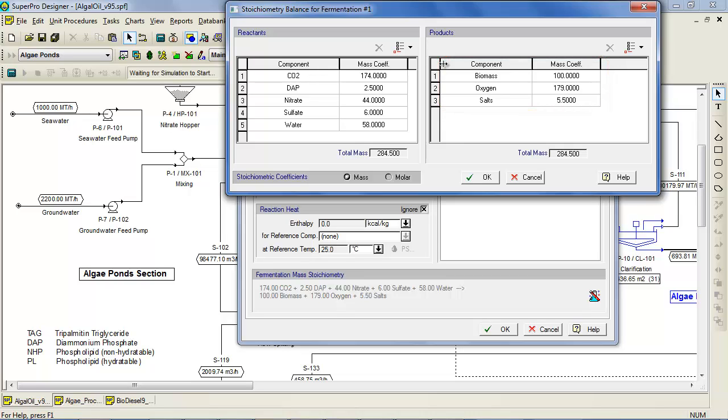Note that the stoichiometry for the reaction must be balanced on a mass basis. Aside from that requirement, you are free to use whatever coefficients seem reasonable in order to represent the consumption and generation of materials, and which will result in an appropriate concentration of key outputs, such as biomass in this model.